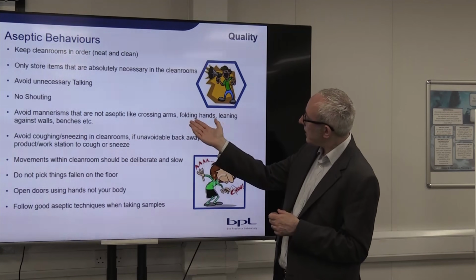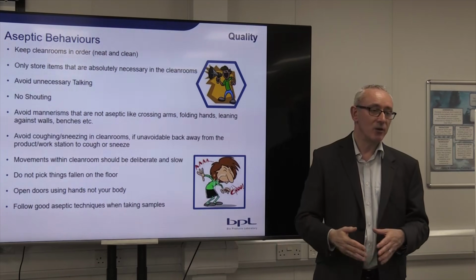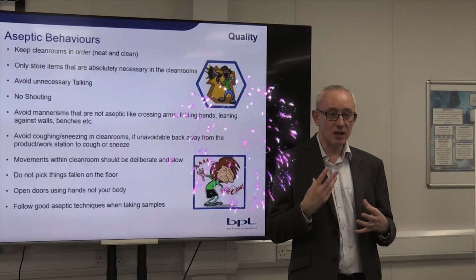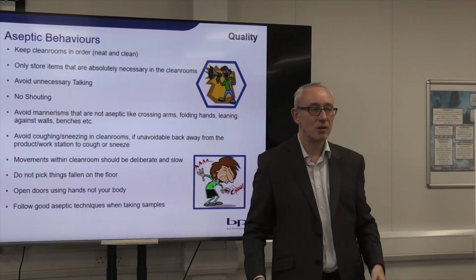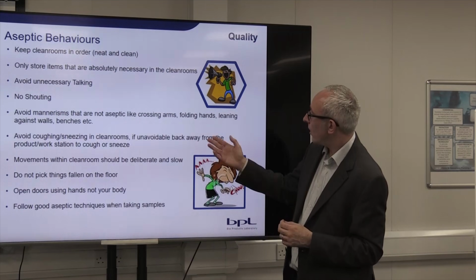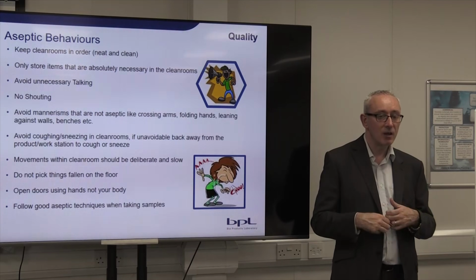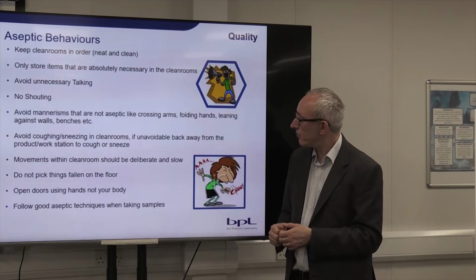And if you're working in the aseptic area particularly, then you have to get used to standing like this a lot of the time, or sometimes like that. But you mustn't do activities that are going to result in skin rubbing or making the body warmer, so not standing folding the arms, not leaning up against objects, and so on. So it is an interesting discipline. Avoid coughing and sneezing, so if you do start coughing and sneezing, you need to exit, at least change your mask. It might just be a little bit of hay fever or something, but if it turns out to be a cold, then stay away. Slow and deliberate movements.